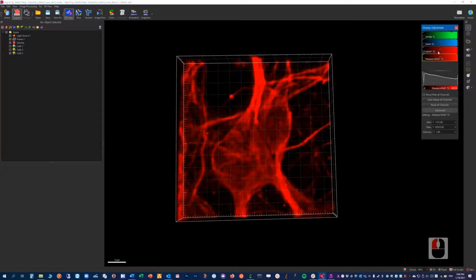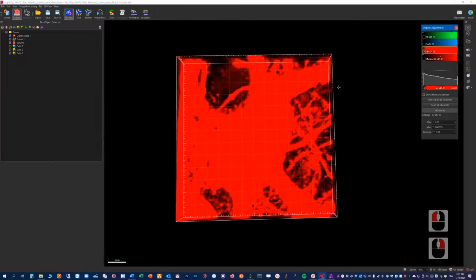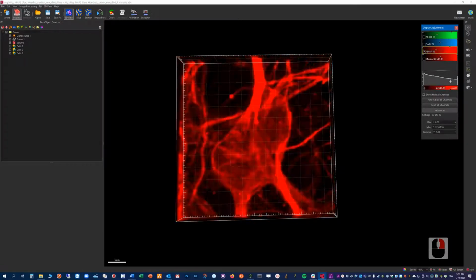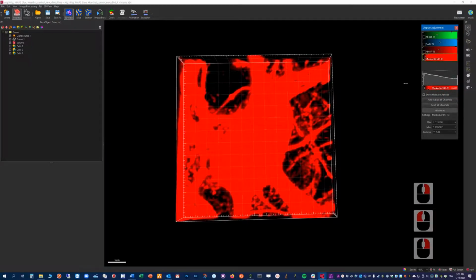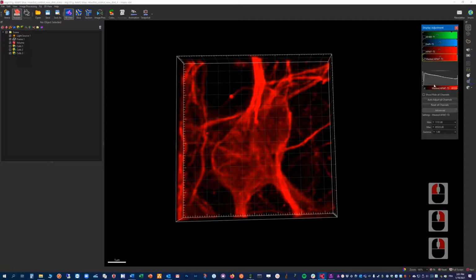We have the original red channel and the duplicate red channel. It's just that in this region there is nothing anymore. While here, I don't know if I can play a bit with the output here. Yeah, you can still see something here. But now, in this channel, there is just nothing. Anyway, so let's use this duplicate channel here to do our processing.